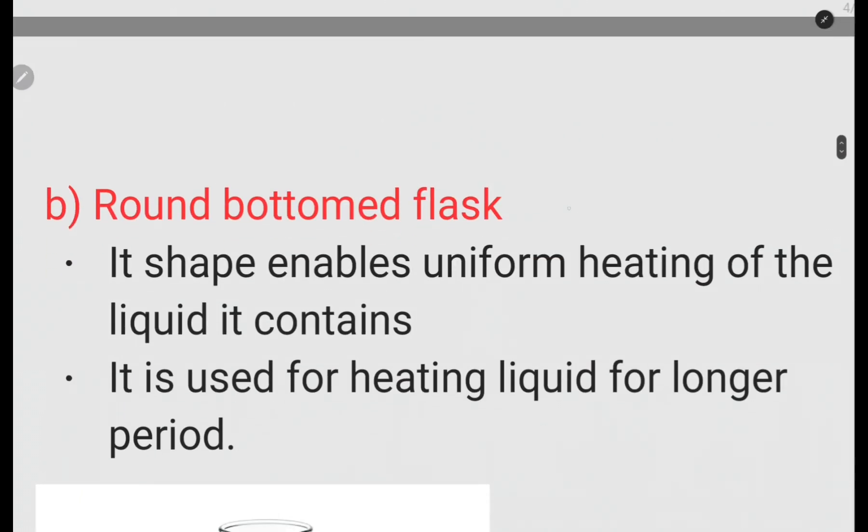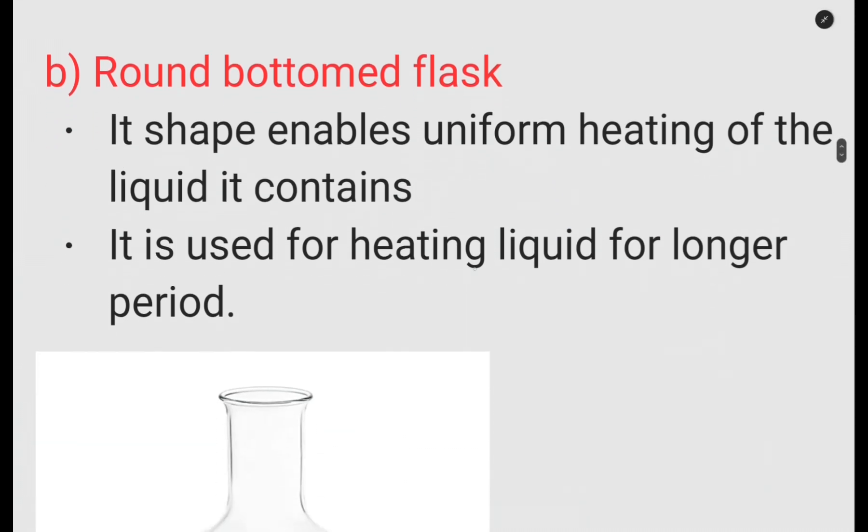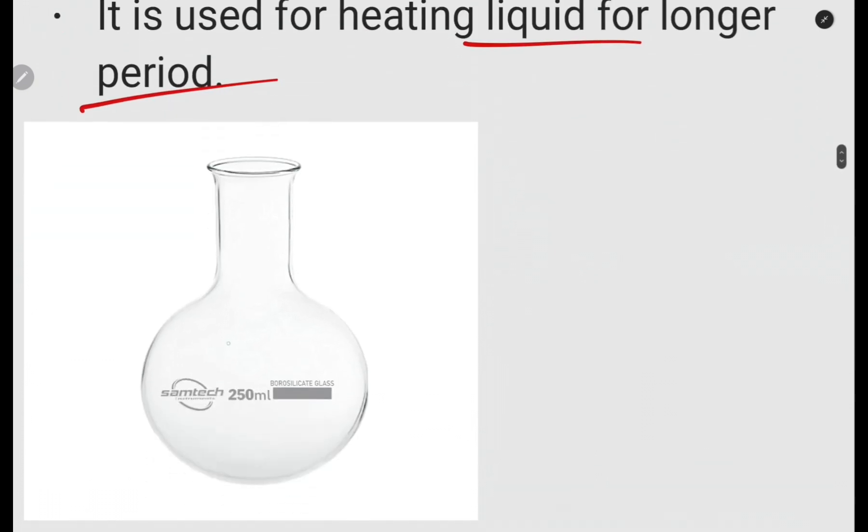The round bottom flask is round at the bottom, and that shape enables uniform heating of the liquid in the container. It is used for heating liquids over a longer period of time.